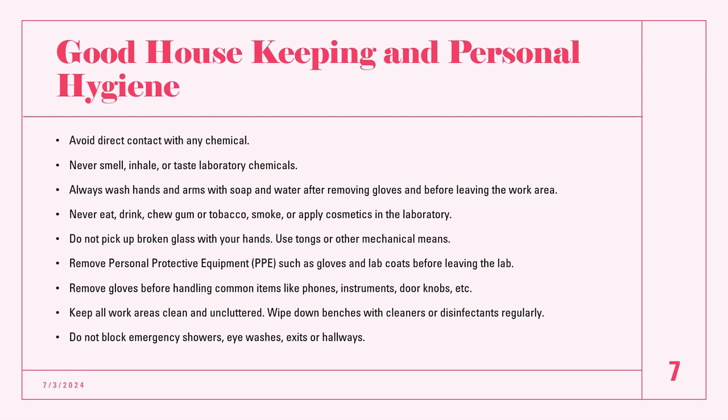Good housekeeping and personal hygiene is important for good lab work. Avoid direct contact with any chemical and never smell, inhale, or taste laboratory chemicals. Always wash your hands and arms with soap and water after removing gloves and before leaving the work area. Never eat, drink, chew gum or tobacco, smoke or apply cosmetics in laboratory. And do not pick up broken glass with your hands. Use tongs or other mechanical means. If not, it can cause injury or damage to your hand.